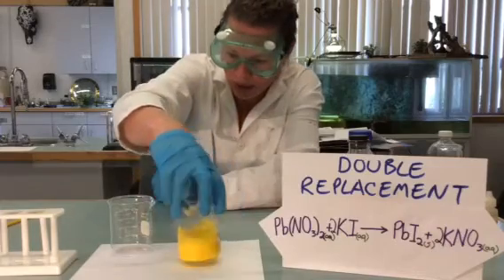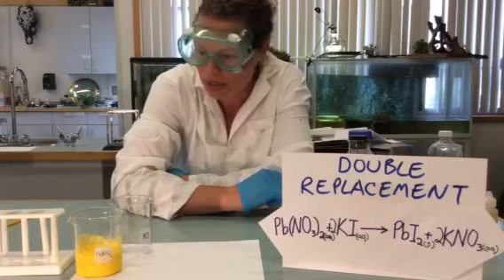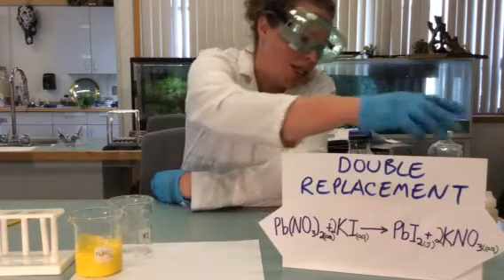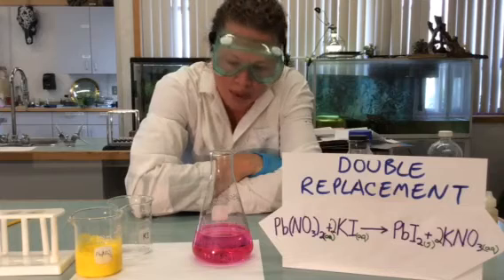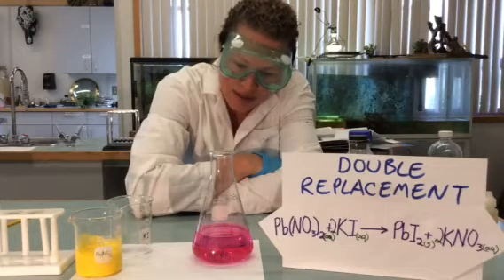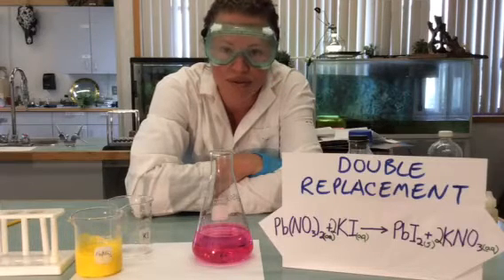Now, just before we move on, I wanted to update you. Speaking of leaving things and coming back to them, this is our magnesium oxide, which has been allowed to sit, and some of the oxygen has actually left the magnesium and entered the solution in hydroxide form.